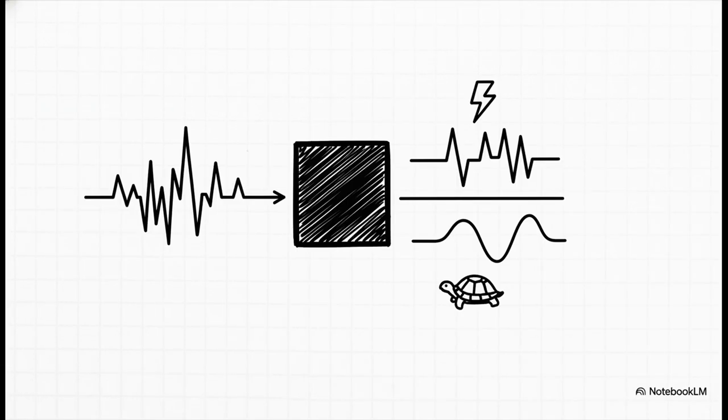But here's the really clever part. Different things inside your cell happen at different speeds, right? Well, EIS can actually separate them. Fast things, like solution resistance, show up at high frequencies on your plot. Slower, more sluggish things, like diffusion, show up at low frequencies. This is huge. It lets you pinpoint the bottleneck. It helps you finally answer, what's the one thing that's slowing my whole system down?